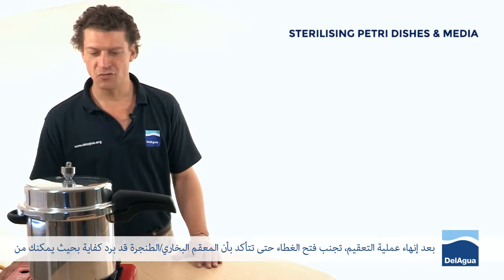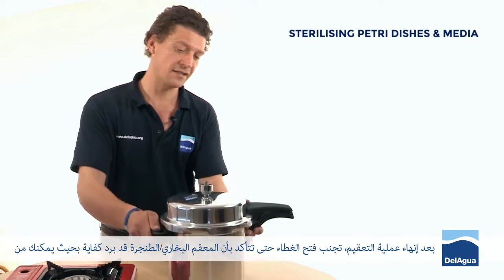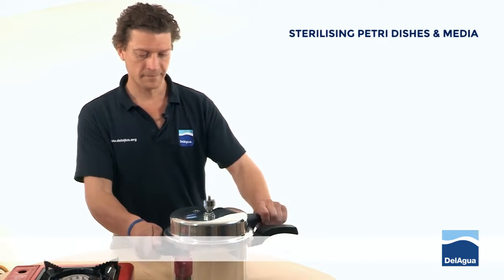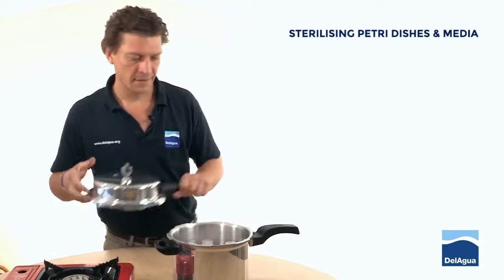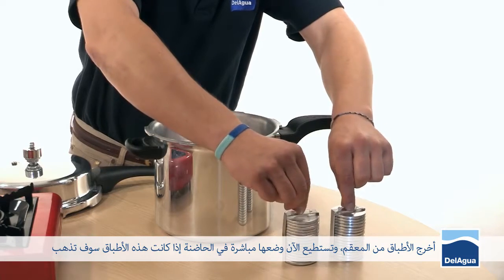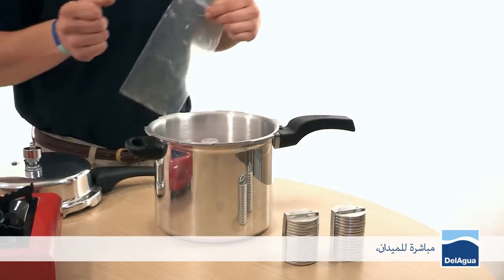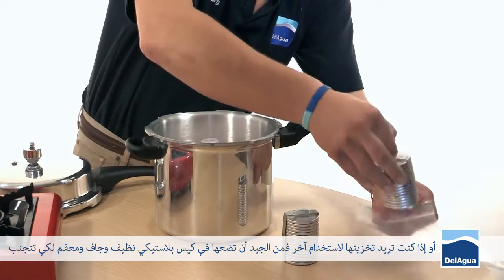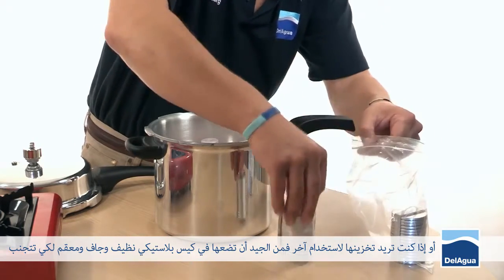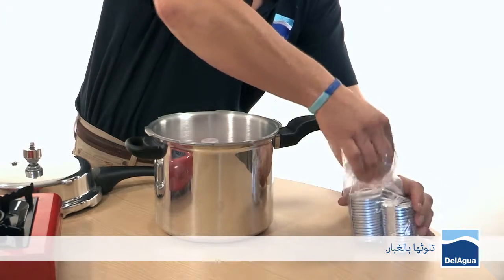Having finished the sterilization run, do not open the lid until the steam sterilizer is sufficiently cool enough to be able to comfortably touch. Take the petri dishes out. They can either go straight back into the incubation chamber if they are going back out into the field, or if you are storing them for later use, a good idea is to place them into a clean, dry, sterile plastic bag to prevent them getting covered with dust.